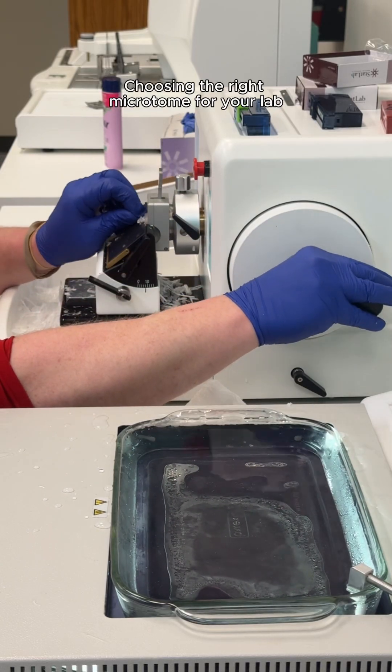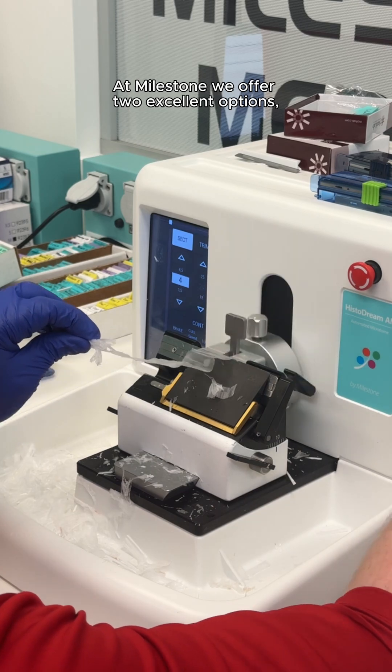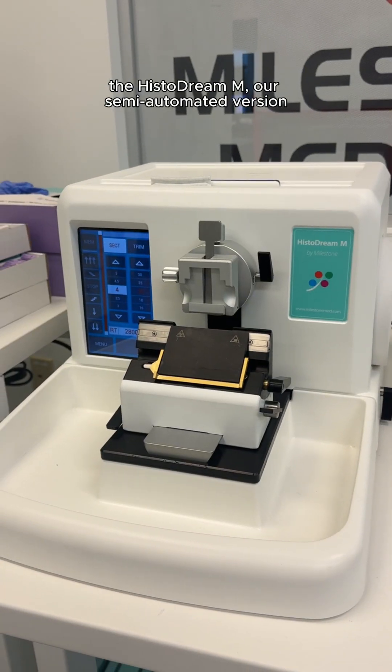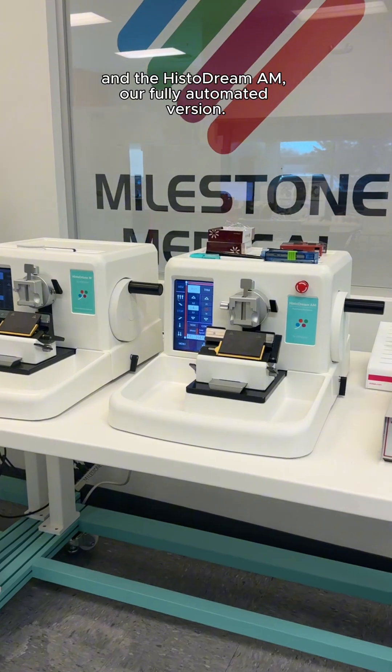Choosing the right microtome for your lab is a crucial decision. At Milestone, we offer two excellent options, so which one is right for you? The HistoDream Microtome is available in two models: the HistoDream M, our semi-automated version, and the HistoDream AM, our fully automated version.